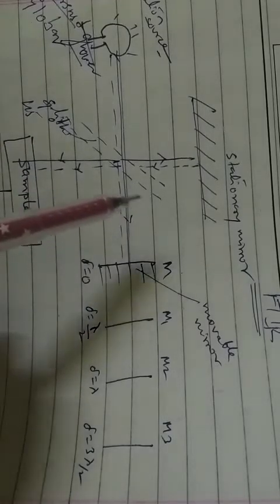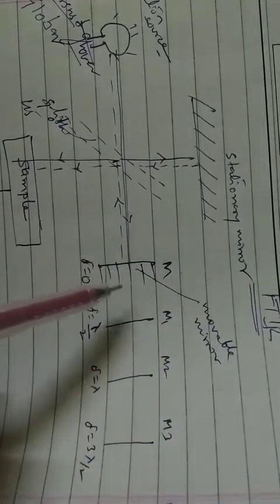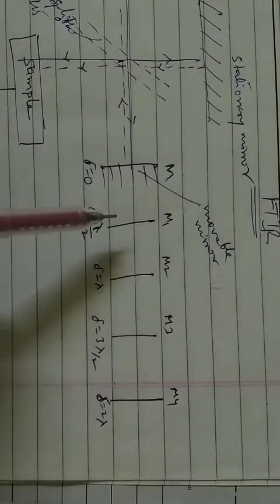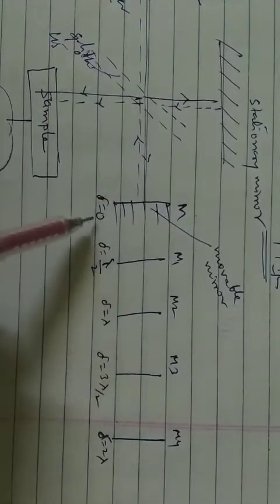You can see there is a stationary mirror here, and this is a movable mirror. This is the specialty of the FTIR. In IR, all these things will not be there, no deflecting and non-deflecting paths. It's simple. But in FTIR, there are different mirrors at different positions.